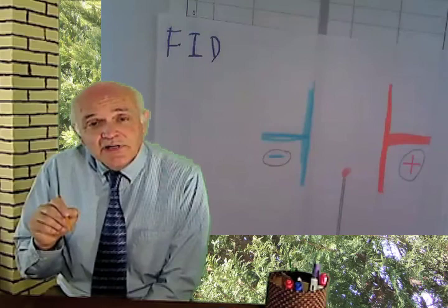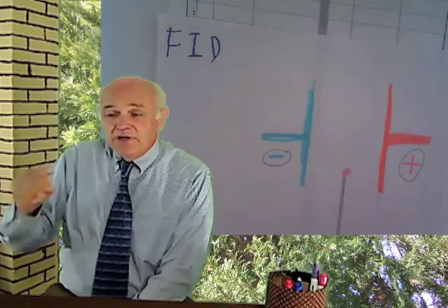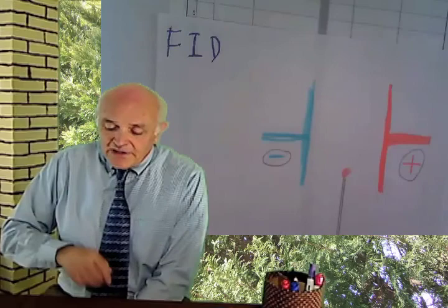In the old days, the analog signal was run into an analog physical device, a strip chart recorder. The strip chart recorder made up a peak on a piece of paper, and that was the signal. In today's modern world of computers, we want to make the signal into a computer-useful signal. In order to do that, we need a time interval. Let's pick a tenth of a second.